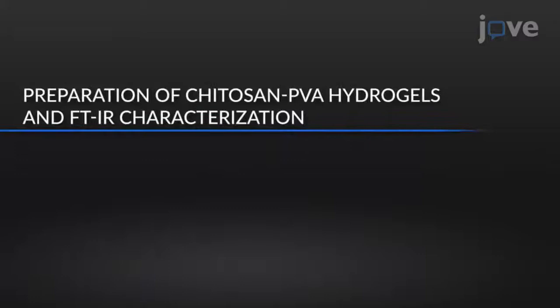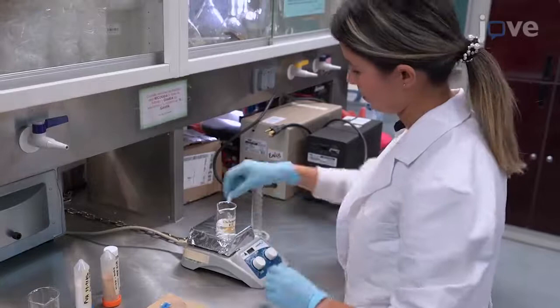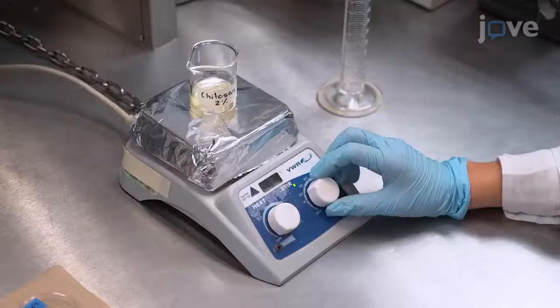To begin this procedure, dissolve 0.2 grams of chitosan in 10 milliliters of 0.1 molar acetic acid at room temperature, and maintain continuous mechanical stirring overnight to prepare a 2% chitosan solution.